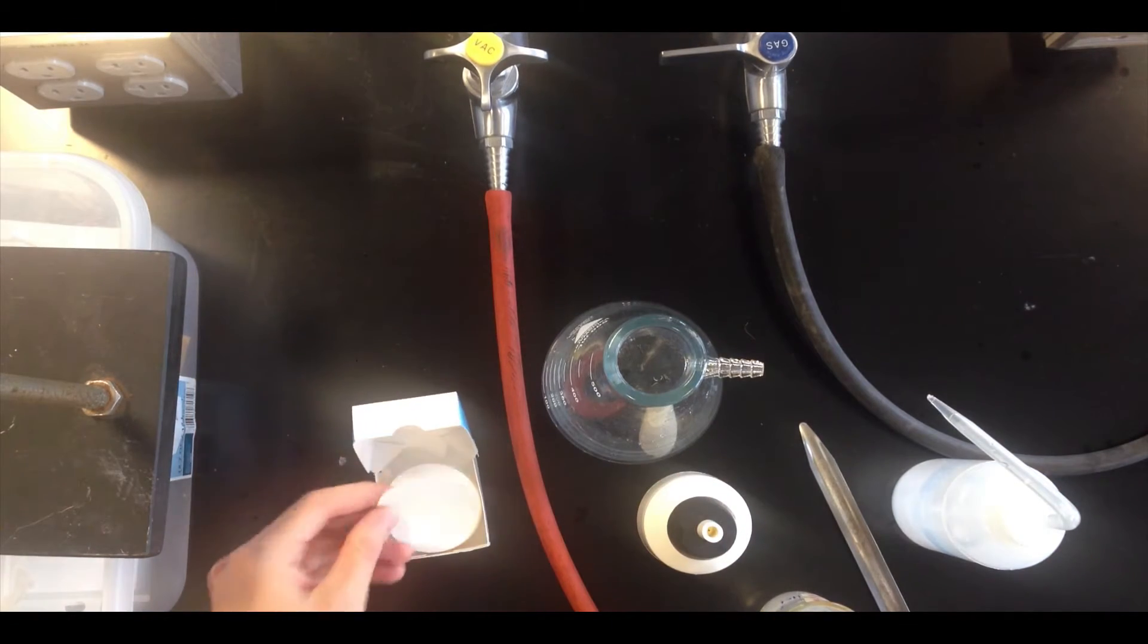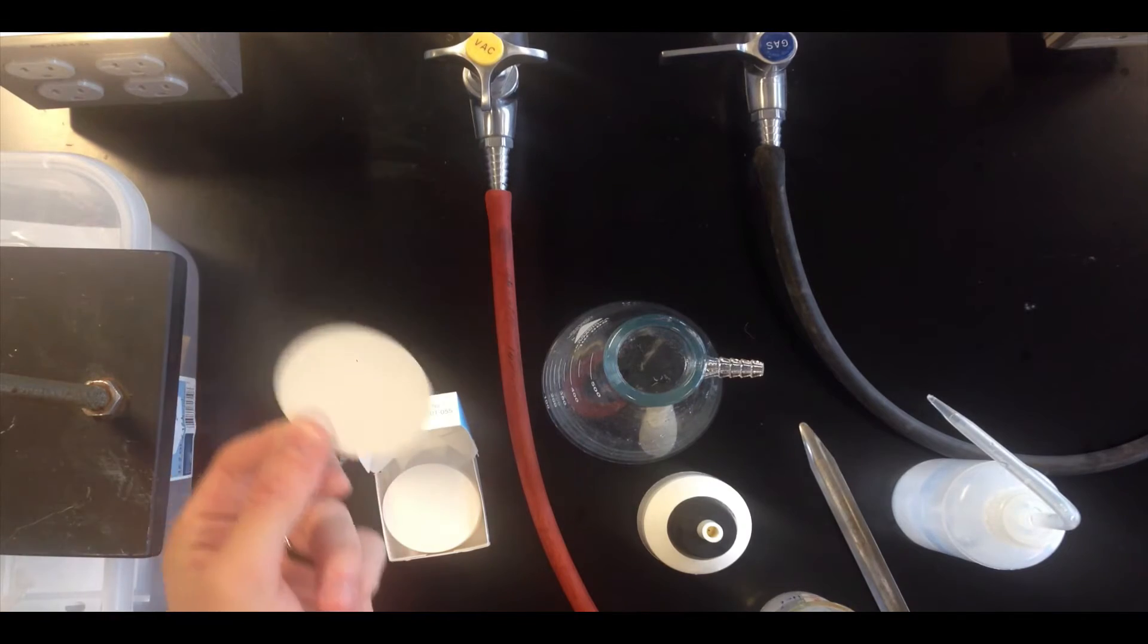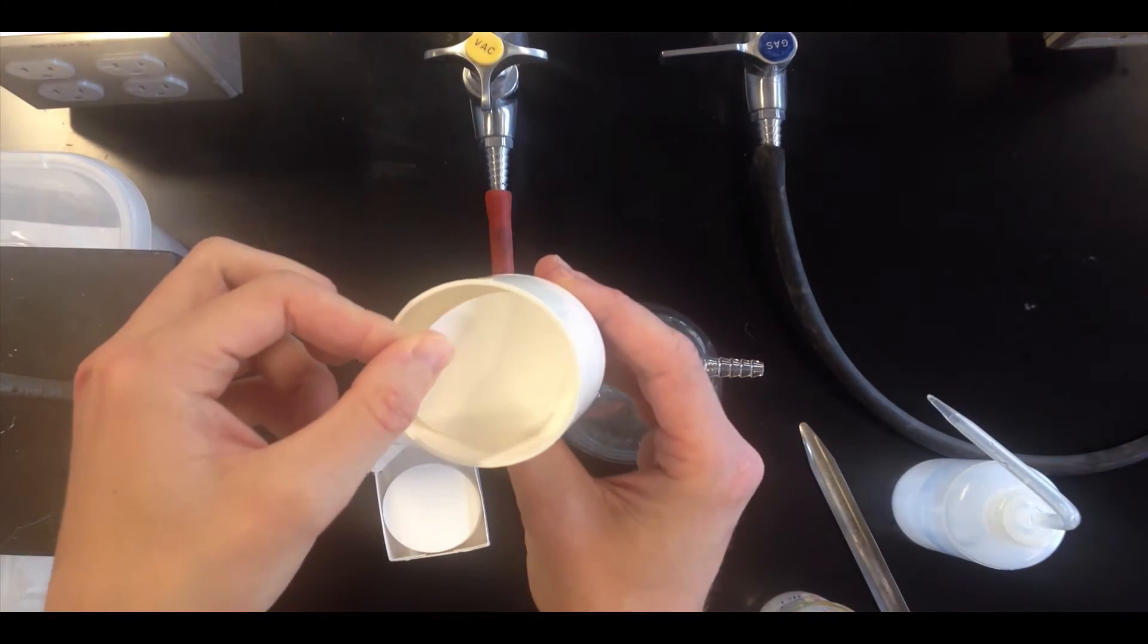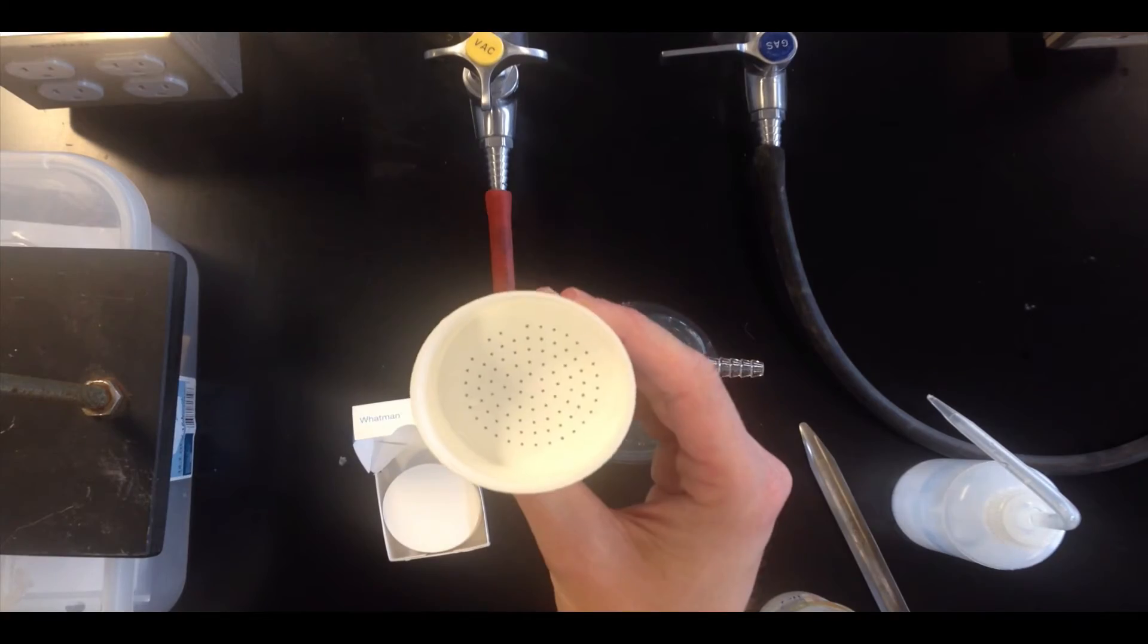The third necessary ingredient here is filter paper, and the filter paper is sized to match the cylindrical part of the Buechner funnel.